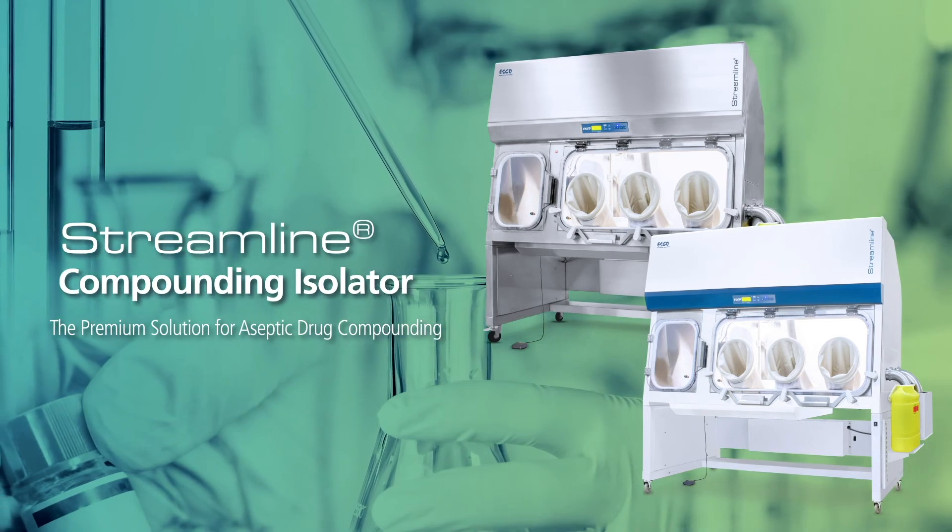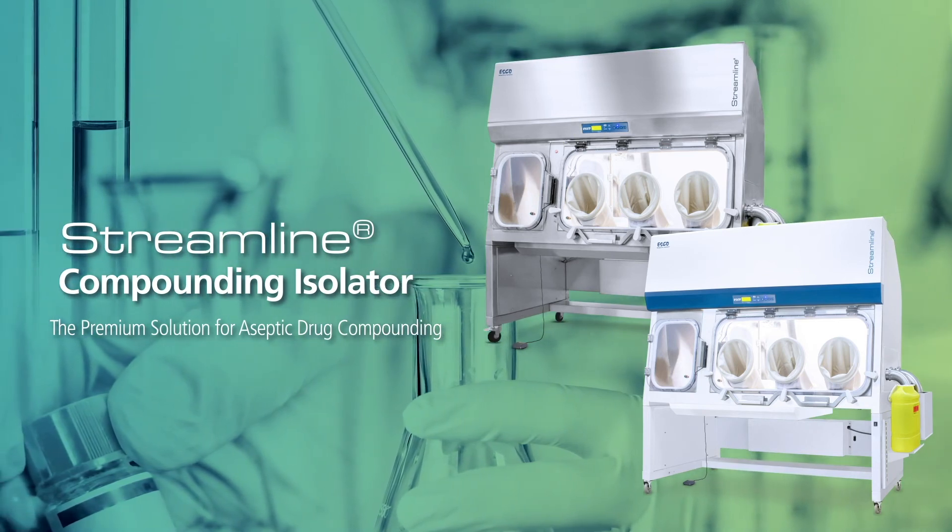Esco Streamline Compounding Isolator. Your premium solution for aseptic drug compounding.